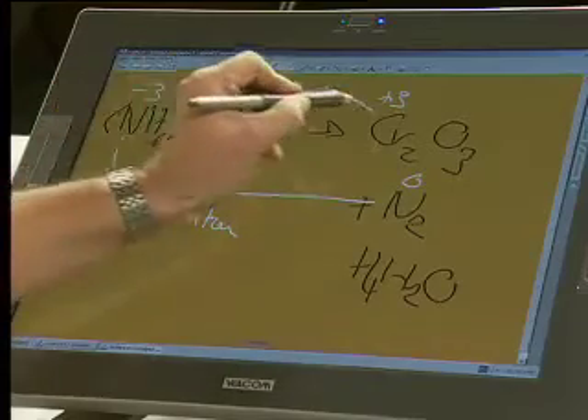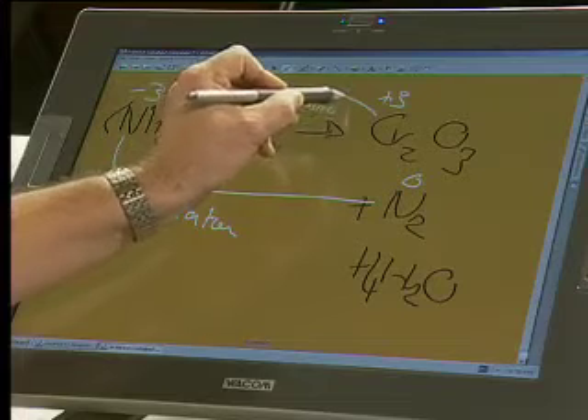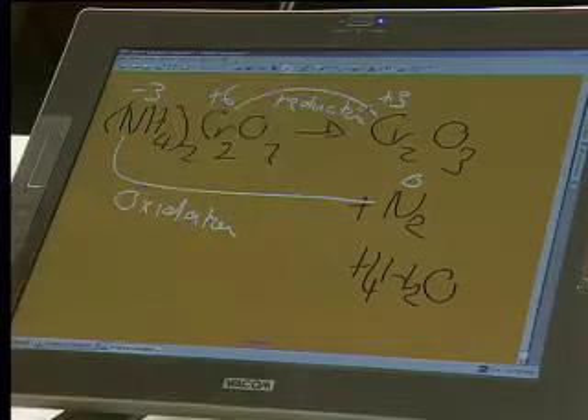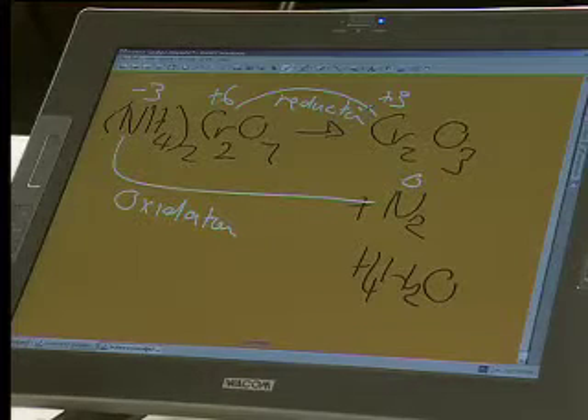And your chromium step is your reduction step — it's a gain of 3 electrons. So we need to understand that the same substance, this orange powder, ammonium dichromate, is a self-reducing substance. When you heat it up, it undergoes oxidation and reduction by itself. The reason this has historically been a very interesting reaction in chemistry is that it behaves just like a volcano.